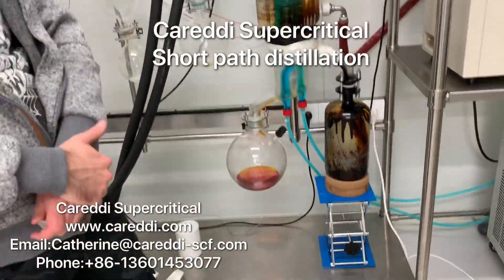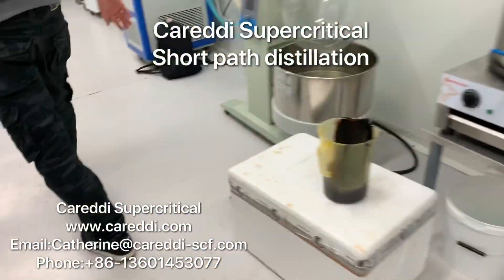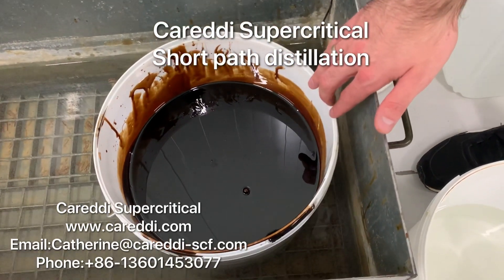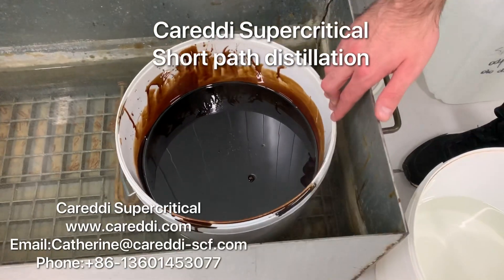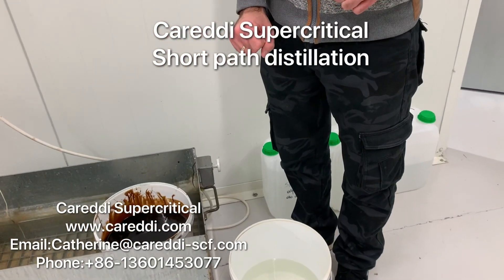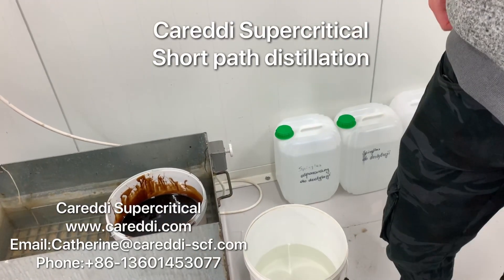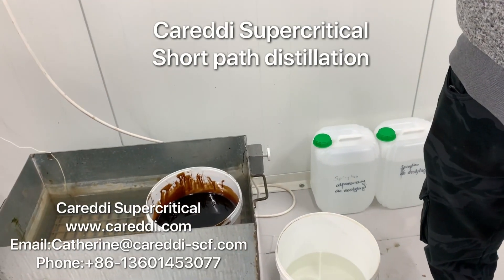In some of these steps we are removing THC. Also with this bucket — this particular one — we can remove the THC. This is now 78% CBD and we can make it 90% CBD, with THC staying as low as 0.19%. It is so simple and easy — less than 0.2% — but I just cannot tell you exactly how because everybody would know it.